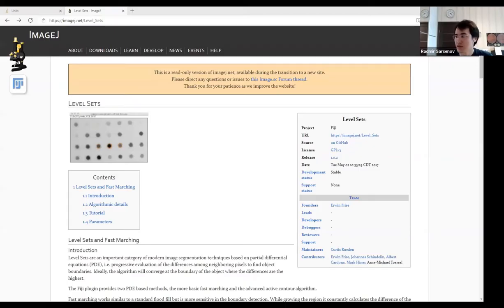For now, I'm just going to show you the website and how to obtain the information on the stuff, like plugins, etc. So let me share screen. Okay, I hope you see my screen now.